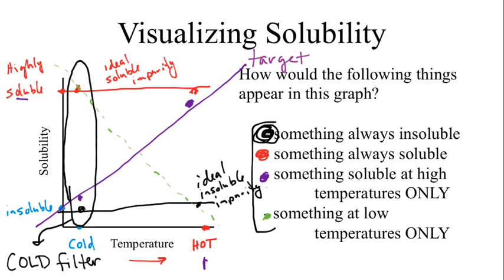What happens if instead of that mixture, I had a mixture of the insoluble impurity and the target compound? Well, if we looked at cold temperatures, hey, it worked once, why not do it again? We'd notice that our target compound and our insoluble impurity both have very low solubilities, which would mean when I add my solvent, neither one dissolves. I can't separate them. So what I need to do is change the temperature. In this case, let's go ahead and heat it up.